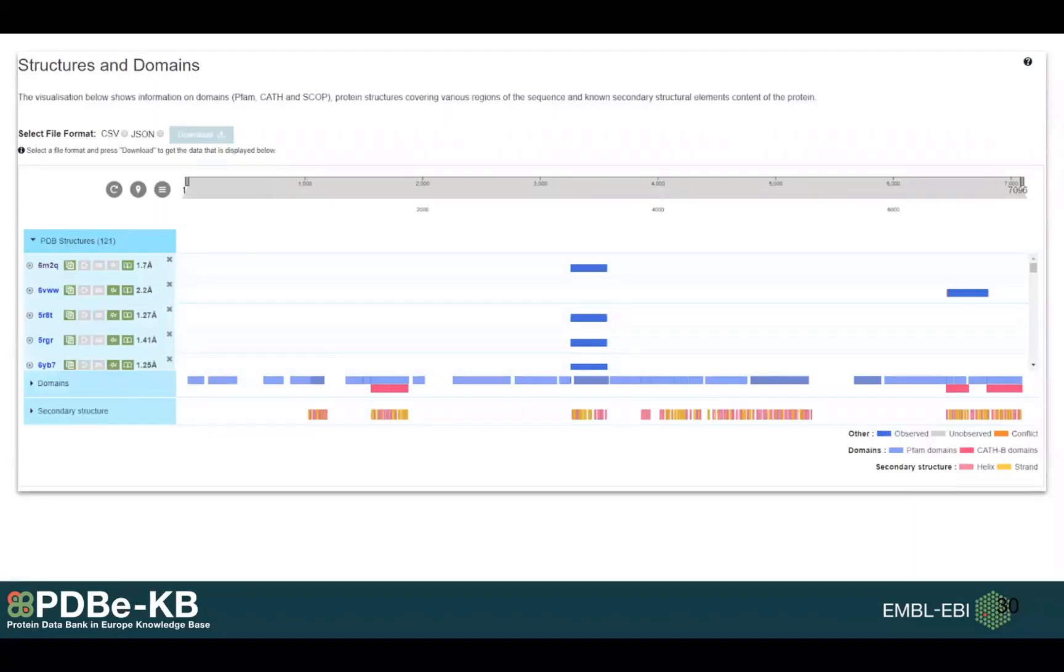Right beneath this section we have Structures and Domains. Here you get an overview of all the PDBs that are covering the different regions of the protein sequence, and you can compare that information with domain mappings and secondary structure information.